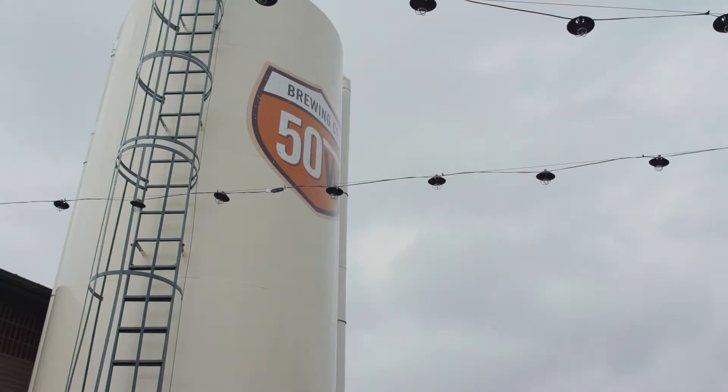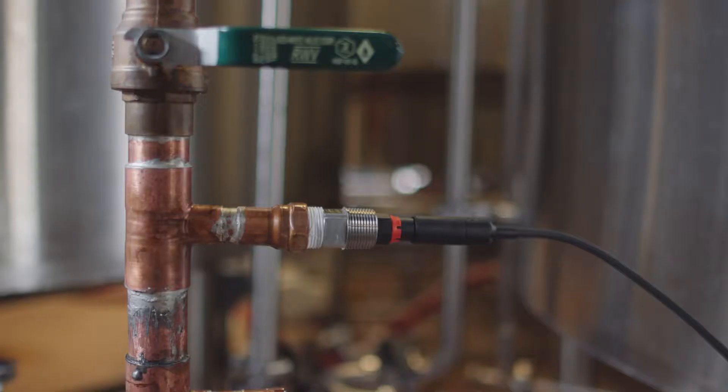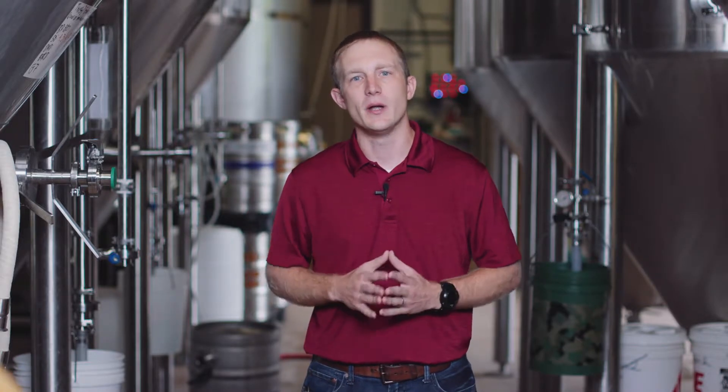Hello, we're here today at 50 West Brewery in Cincinnati, Ohio, where I'm going to walk you through setup and configuration of their Kinnick Stratus Evo transmitter. This MemoSense pH loop will be measuring and controlling the acid dosing of the incoming water. This ensures the water is within specification prior to the start of the brewing process.